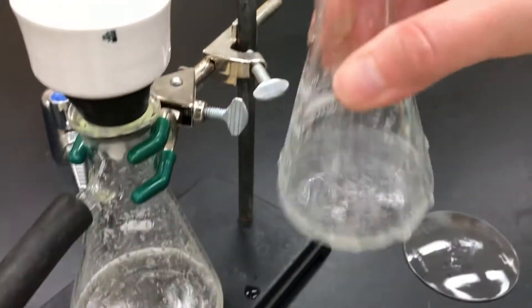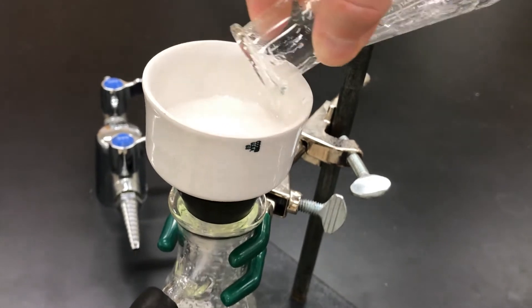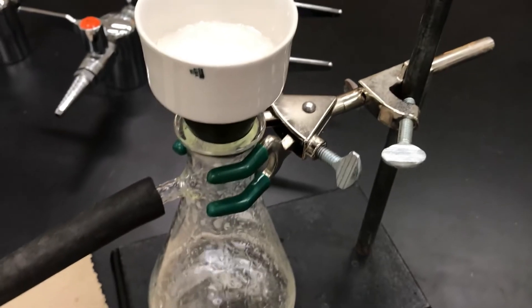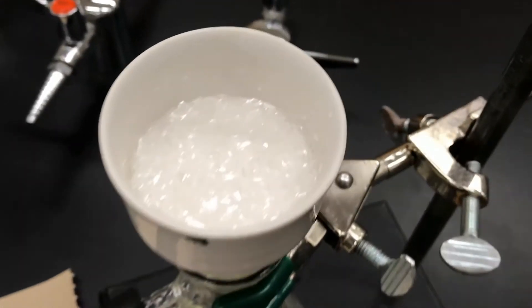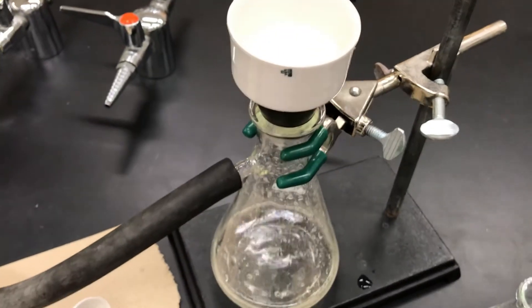And then do another swirl and dump step. There's going to be some residue that is going to stay on the flask and that's okay. Don't try to get every speck out. But here we have our beautiful crystals that I've collected.